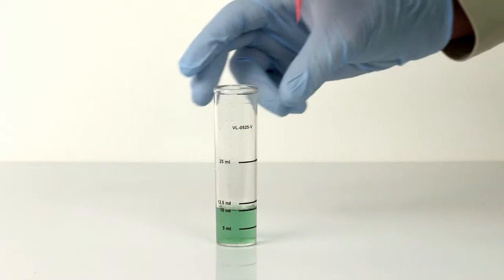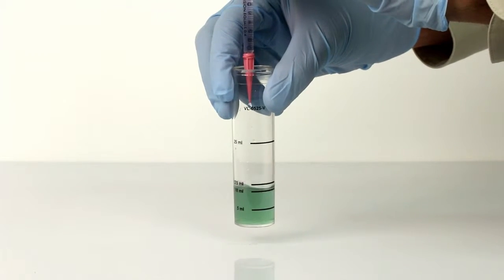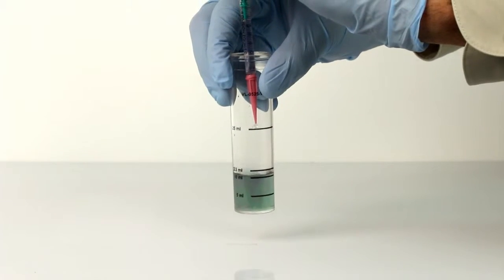Using the syringe, add OP titrant to the sample. Swirl the vial as you slowly dispense the titrant from the syringe.